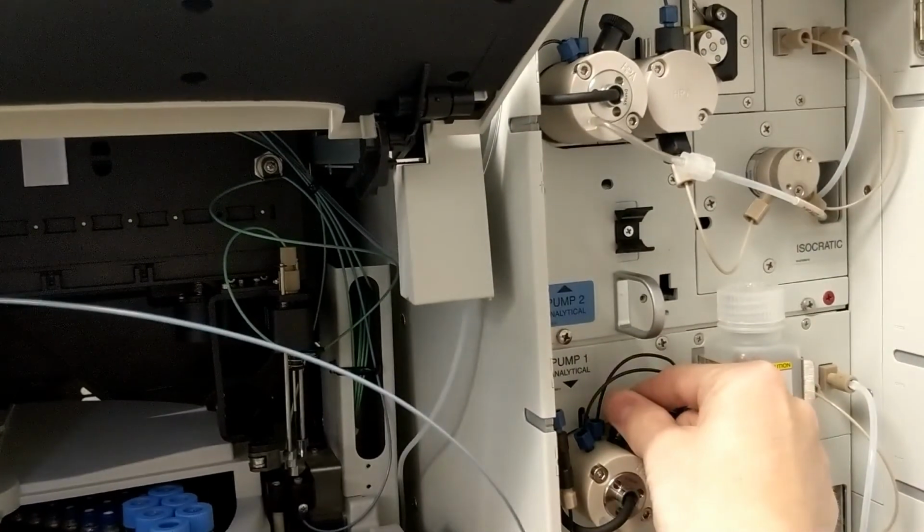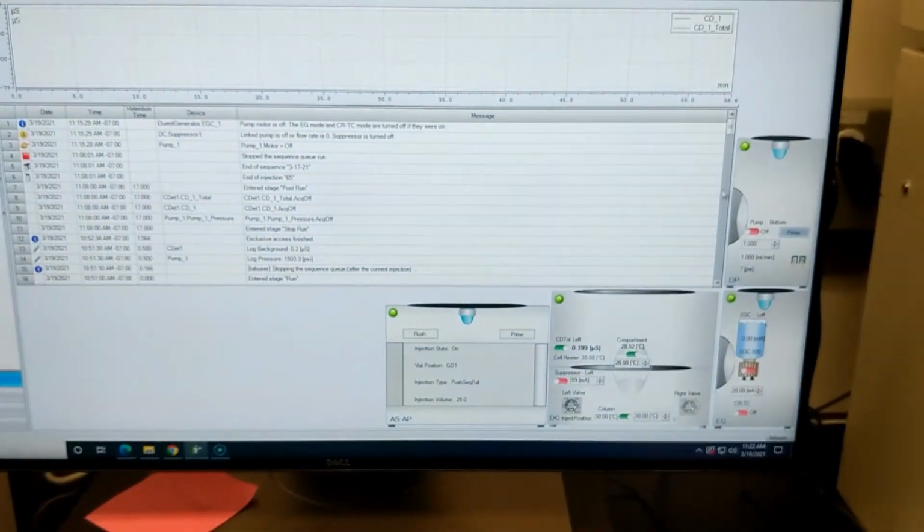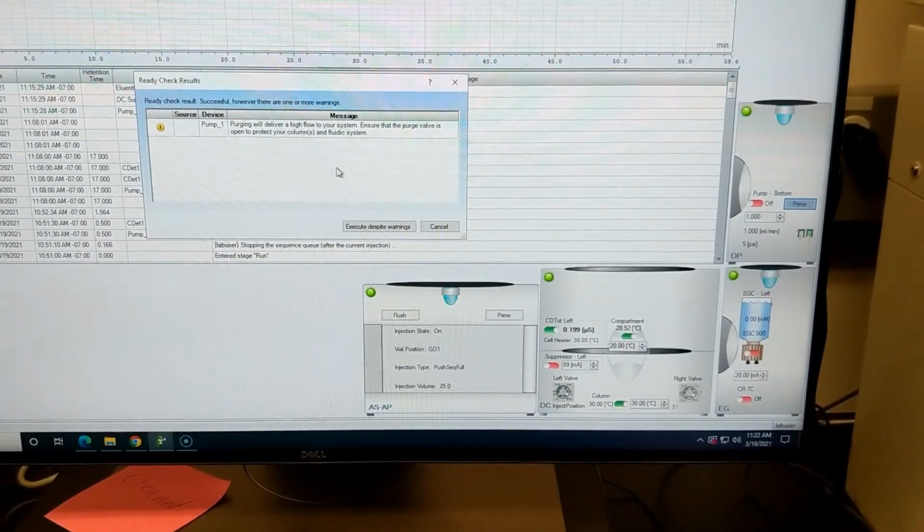So just one little half turn to the left for both of them, a little half turn. And then we're going to come into our instruments. Now this is the cation side, and I'm going to hit prime right here. Now it's going to give me a warning.